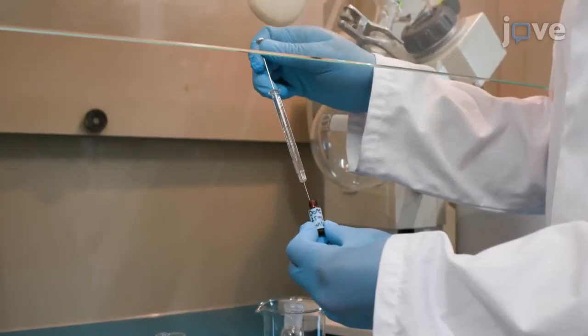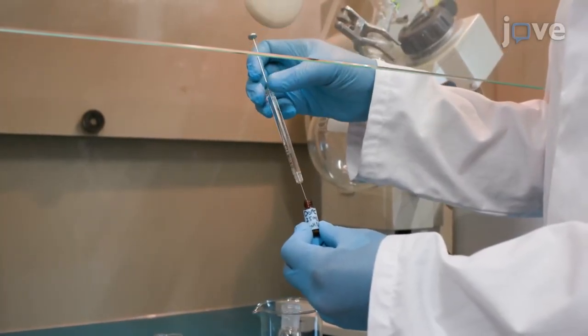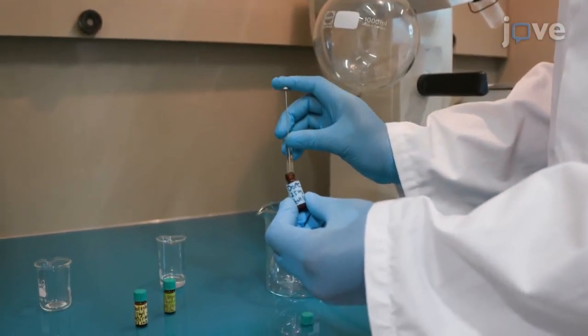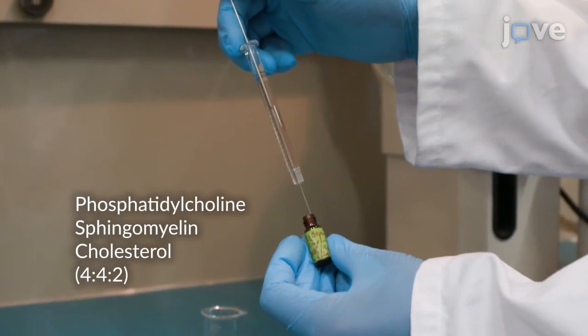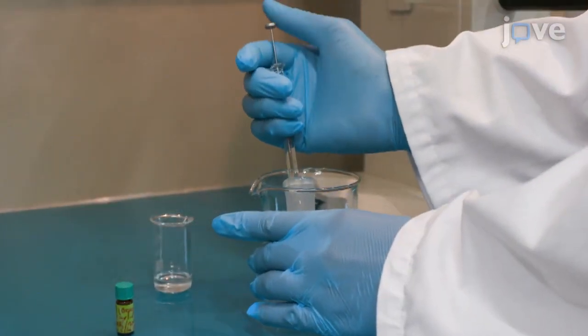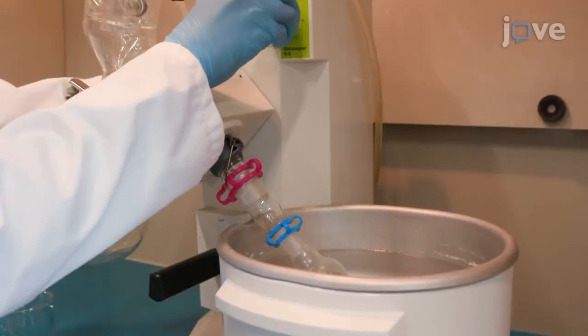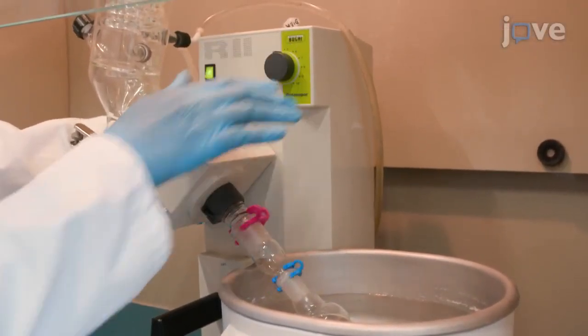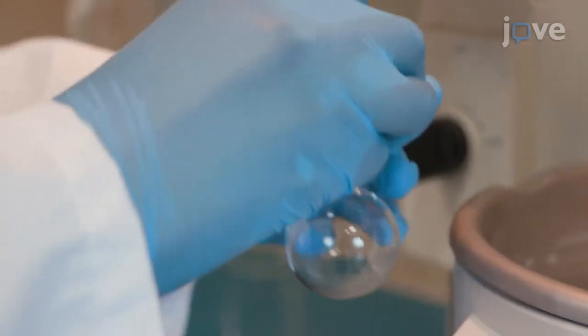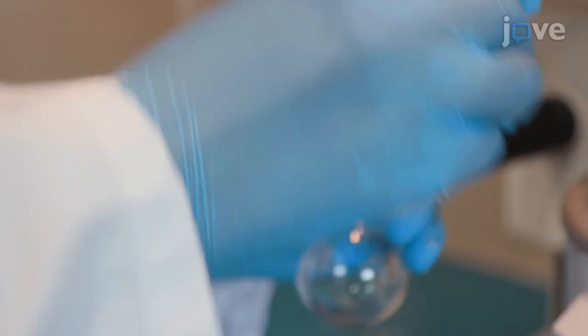To prepare LUVs for their use as cell membrane mimics for a fluorescence leakage assay, use a Hamilton glass syringe to mix phosphatidylcholine, sphingomyelin, and cholesterol at a 4:4:2 molar ratio. Use a rotary evaporator to evaporate the methanol chloroform under vacuum for 46 to 50 minutes at 60 degrees Celsius until a dried lipid film has formed.